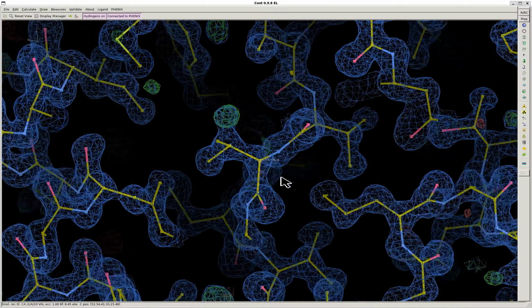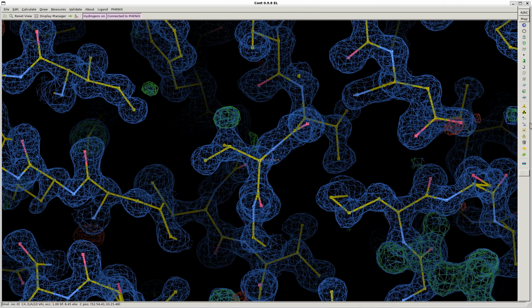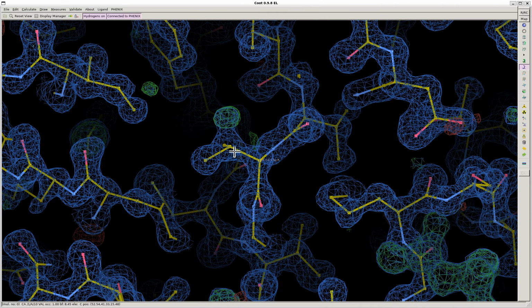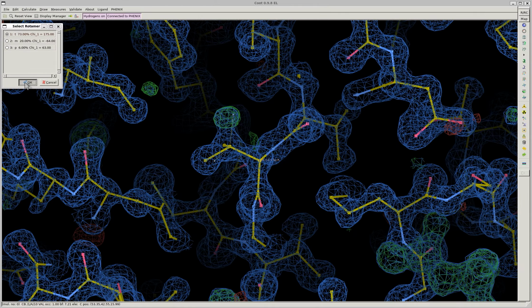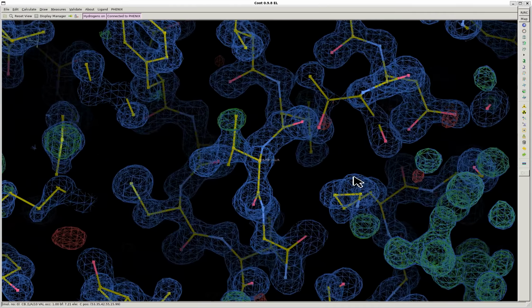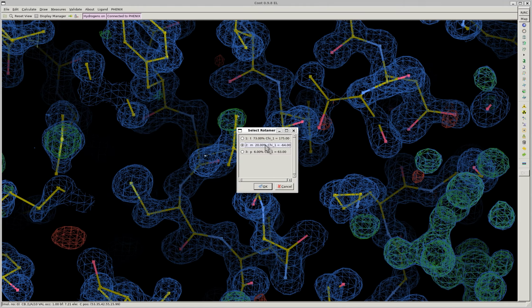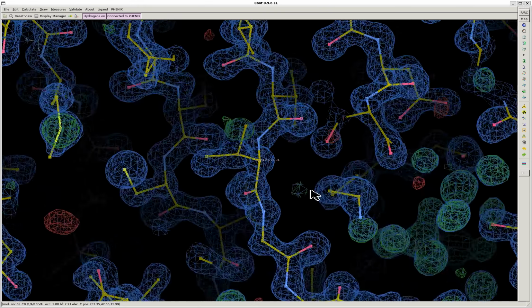Oh yes, this is a very good one. Let's do rotamers. Click this guy. Yes. There. Oh, this is not good. Rotamers again. That's much better.